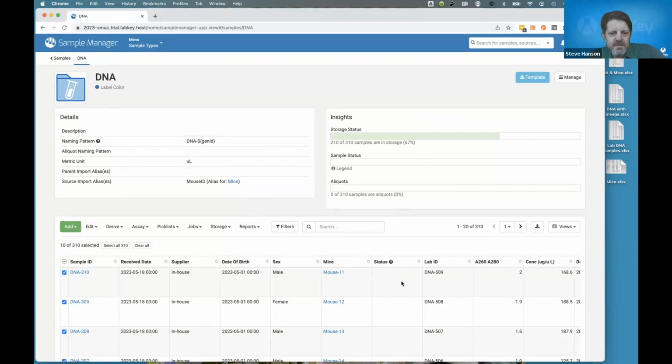Another question: is there a way to only show boxes that are open? We have a ton of storage, and clicking through to find an open box seems cumbersome. Yeah, this is really an active area that we're working on improving. Being able to navigate users quicker to the places that they care about is very important to us. And this exact thing is something we're working on right now with our UX designers, of how we can improve that experience for folks.